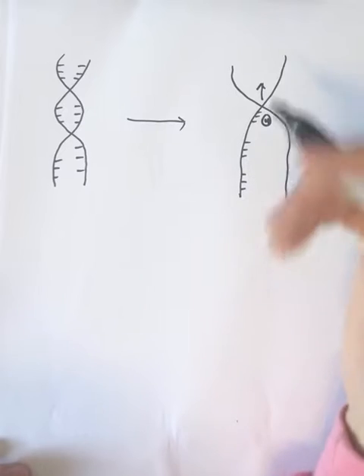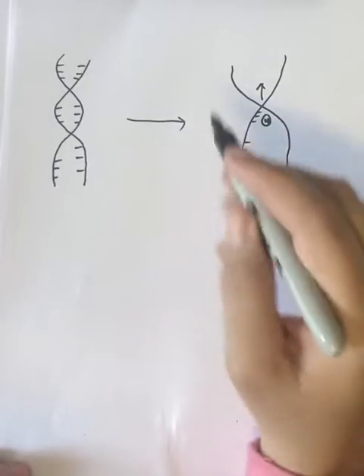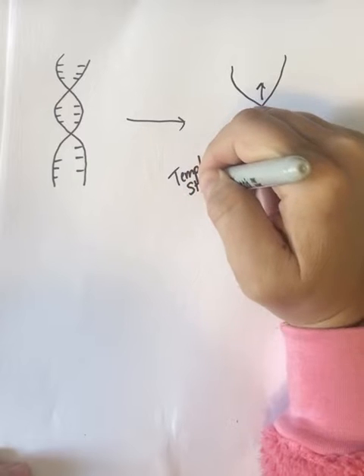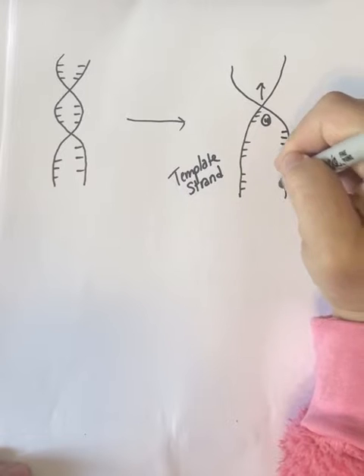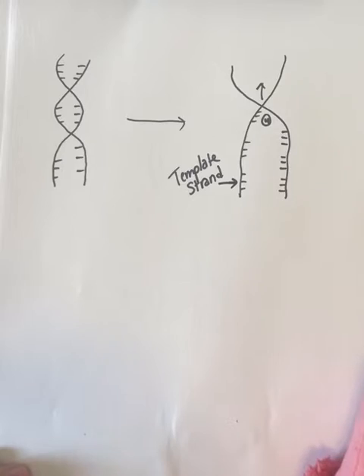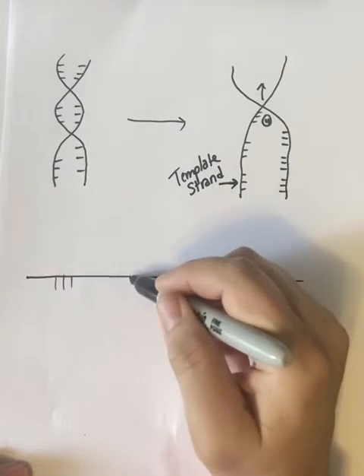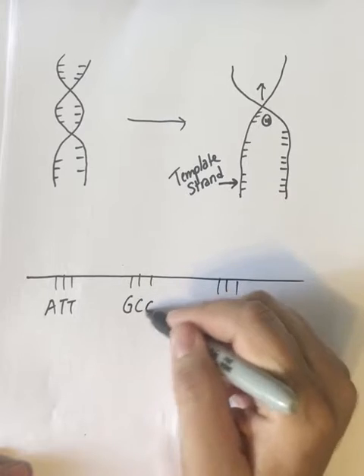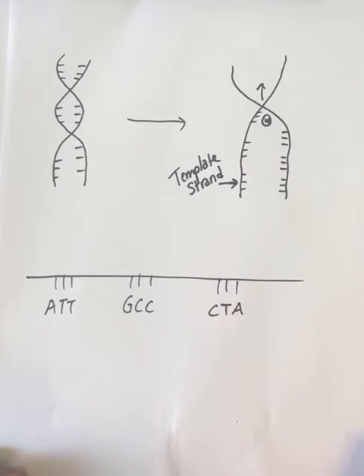and they put this DNA into a chemical reaction, and they had to do a couple of things. So we're going to take this and we're going to call it the template strand. And the template strand in replication is going to be used as a way to copy. So in the Sanger sequence, we take this strand of the DNA and we figure out the template. So we took half of the DNA. Let's just say it's ATTGCCCTA. This is the template strand.